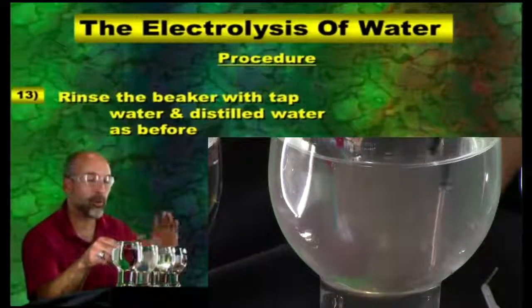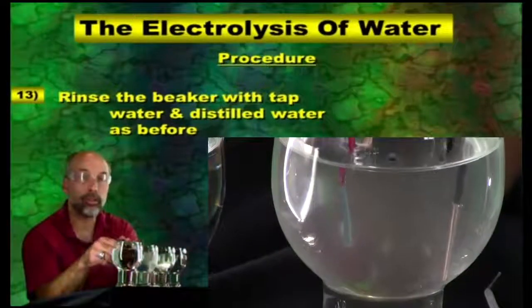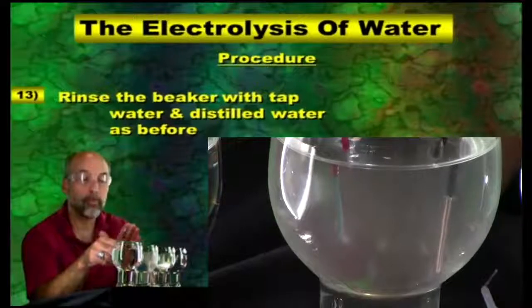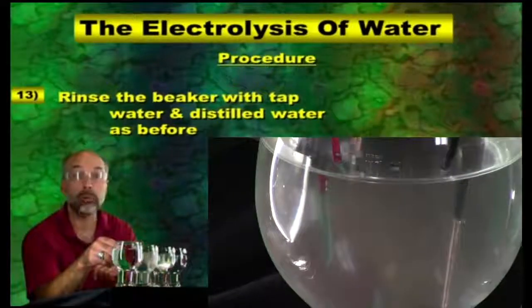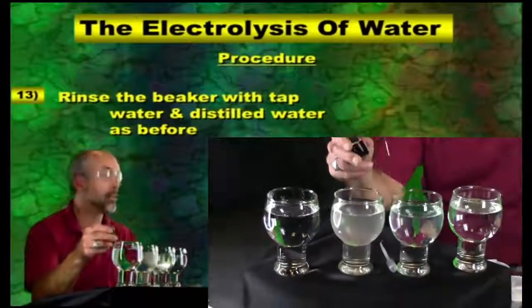So we look at this and we have water is covalent, no electricity. Sugar is covalent, no electricity is conducted. Baking soda is ionic, we saw bubbles. All right, so we look at that and say, okay, nothing much happening there.